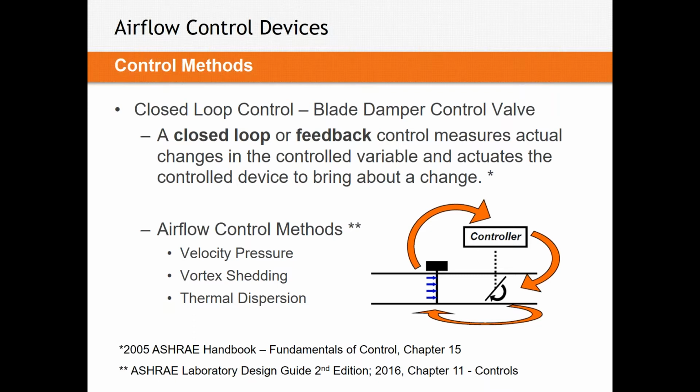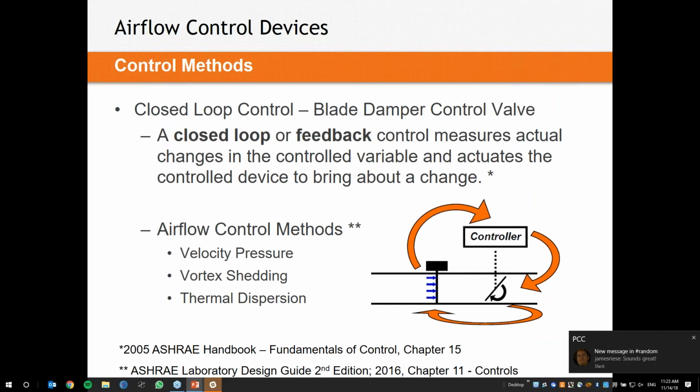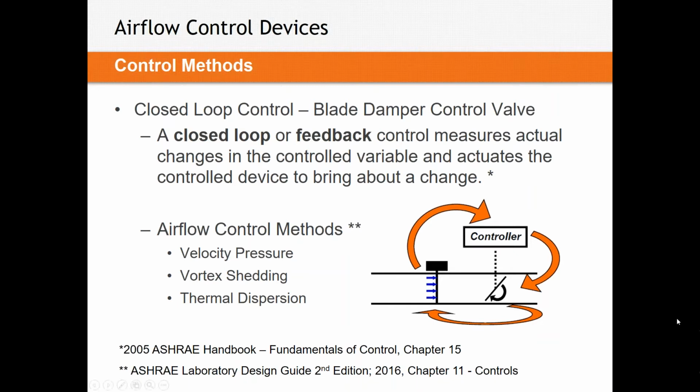Now again, we've talked open loop and we've talked closed loop. When we are looking at closed loop valves, as I mentioned, there are a lot of manufacturers out there and there are a lot of different ways to measure airflow. And I want to note here, I'm not saying ways to measure pressure. There are another 100 ways to measure pressure. What I'm mentioning here is across manufacturers, there are just different ways to measure airflow.